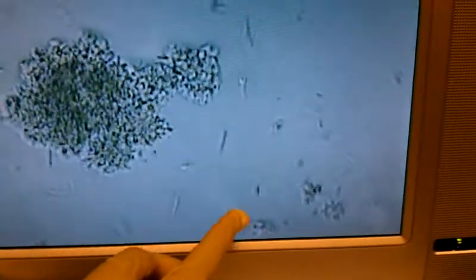Eventually you see these two are really close right here, and they'll probably form in together eventually. As it weighs down, it's heavier, and single ones go to them. So all these rosettes are just really like little small rivulets like this one. They go to this one, and then all the other ones form, and then they get to a really big one, and then the big one will form with a big one. Like these two are close together, they'll probably end up together again. So this is a day at the lab with me.